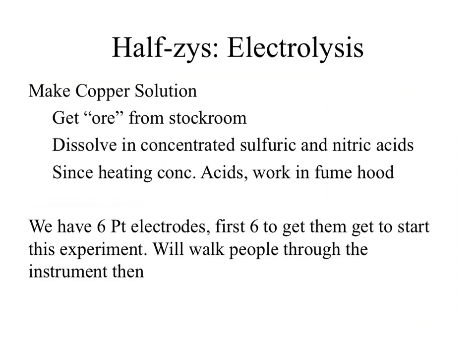The first 6 people that have their solutions ready can then immediately get the electrode, and then I'll talk to you more about how to use the equipment in the other room. Okay, you guys remember the blender looking things at the end of the room in our equipment room? Anybody? Yes, that's what you're working with. Okay, so you'll be playing with those today, at least 6 of you. That whole process takes roughly 30 to 40 minutes, maybe upwards of an hour. So if someone wants to, after the first wave goes through, we might be able to sneak another set of students in. Okay, but it's kind of up to you if you want to try that or not. You'll probably push your limits on time. Okay.